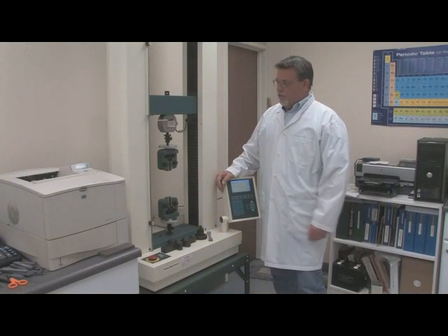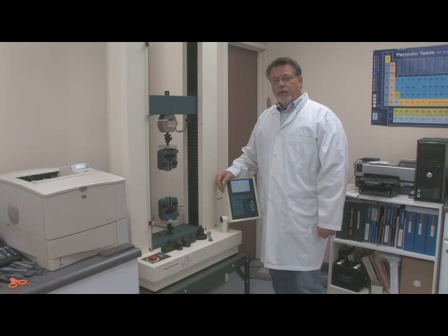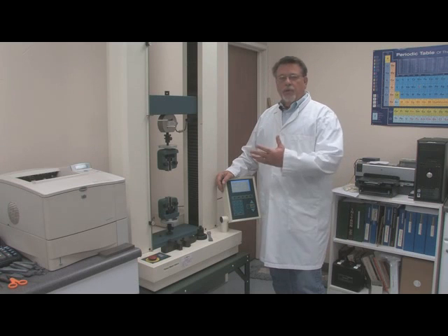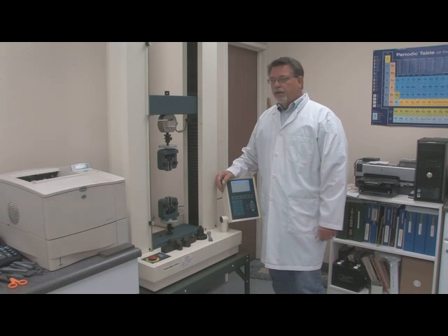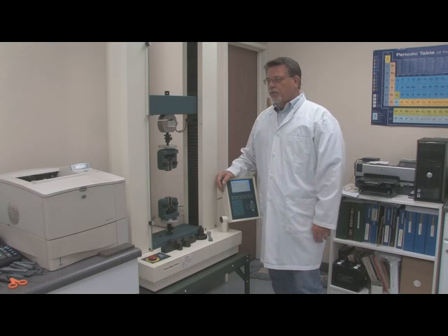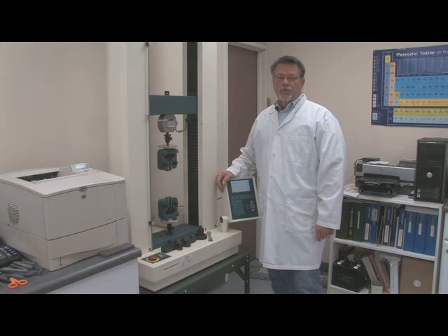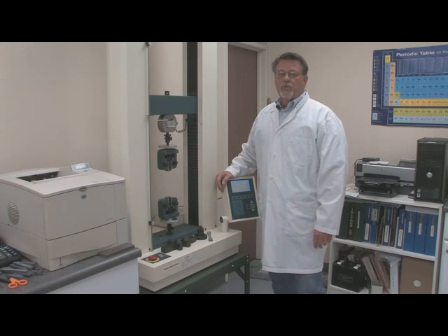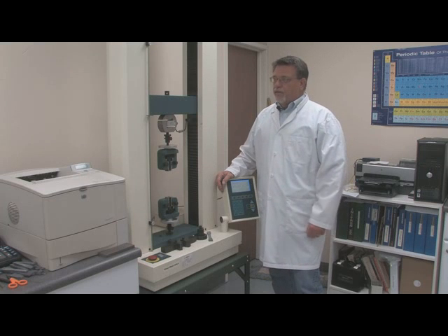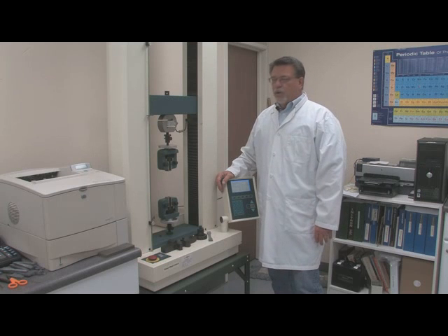All of that can be done on this particular device, and we can set it up to really do any combination of speeds and tensions and so forth to be able to generate reports for customers, and again, partly to be sure that materials that we're making ourselves are in spec, and secondarily to be sure that the materials that we're getting in here are in fact what they are supposed to be. And that sometimes includes customers' materials.